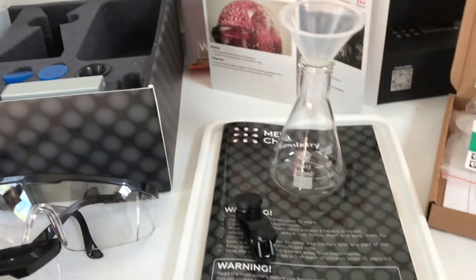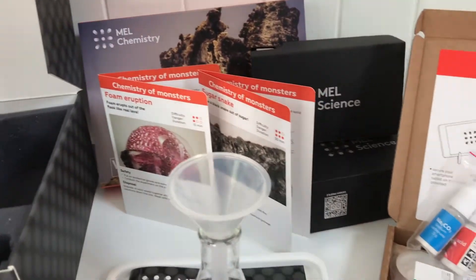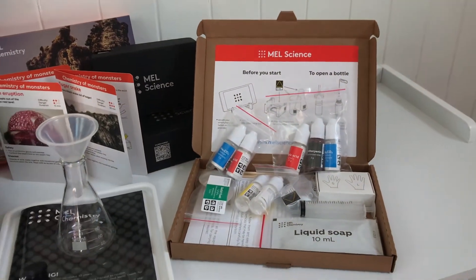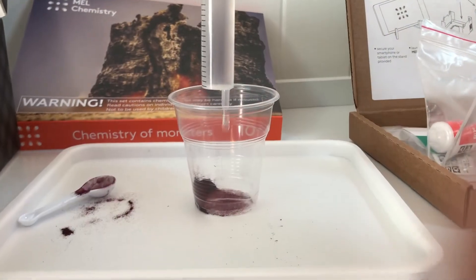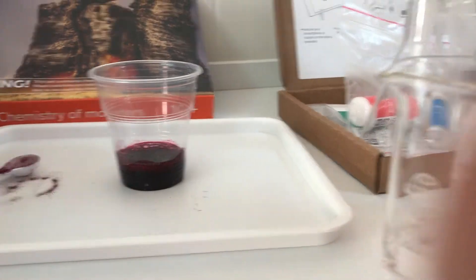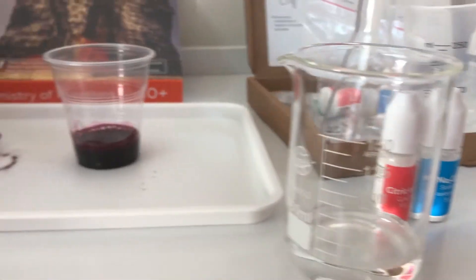Now we've got the starter kit laid out here with the beakers and the safety goggles. You can see we've got the contents of our subscription chemistry set set up here. Let's do an experiment and see what we can do with this. In this particular experiment, we're going to do a "foaming monster," as it's called. The idea is we're going to mix a few substances together and make some foam explode out of the beaker.